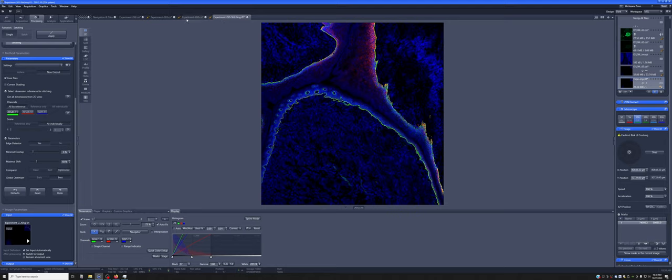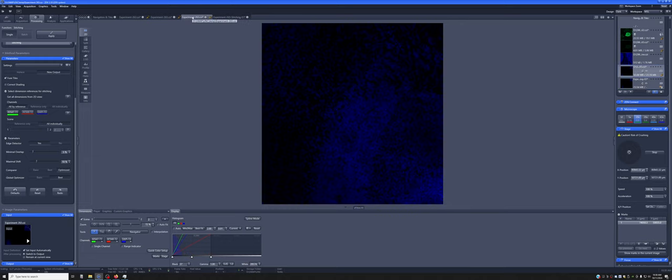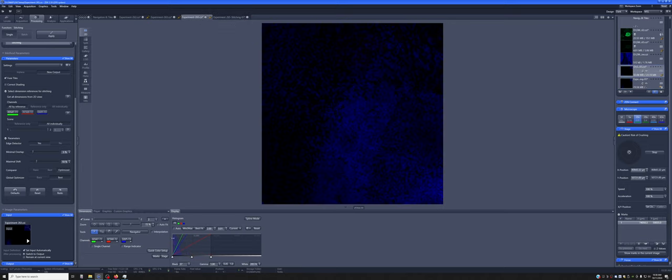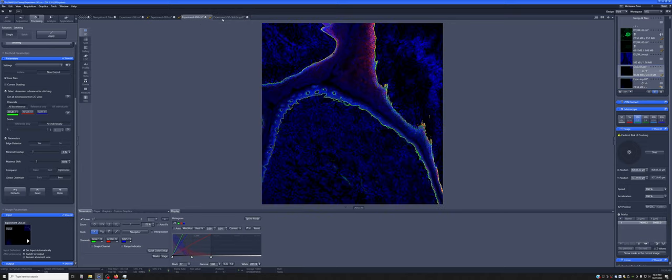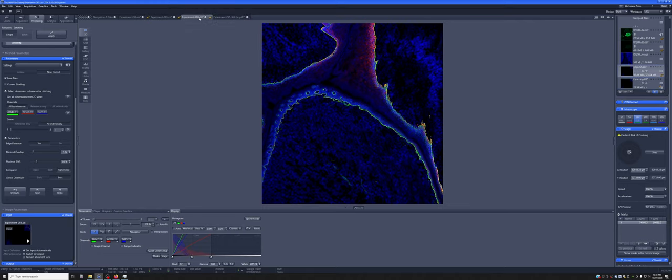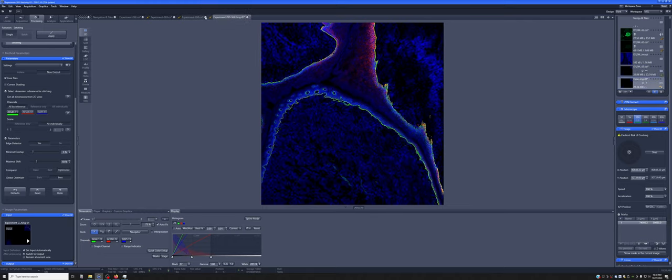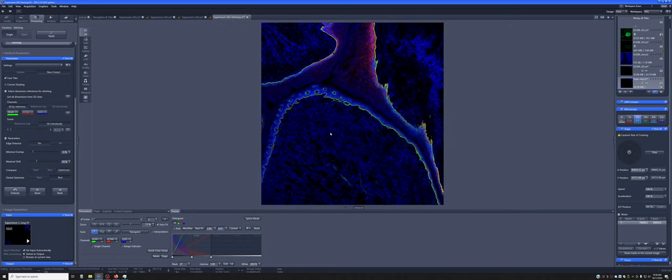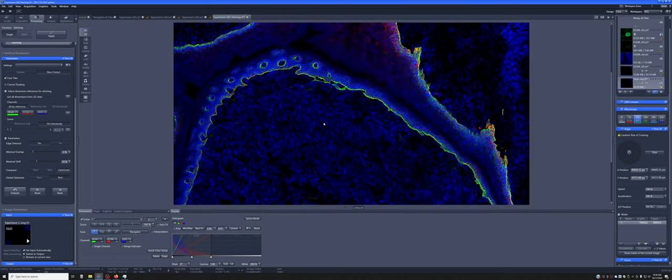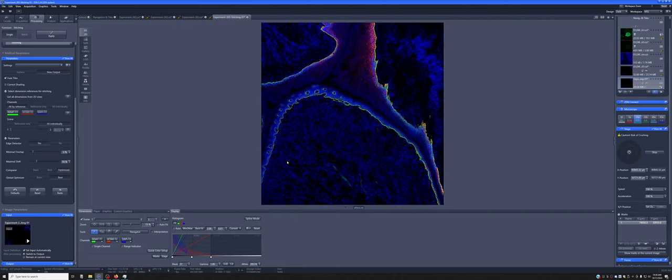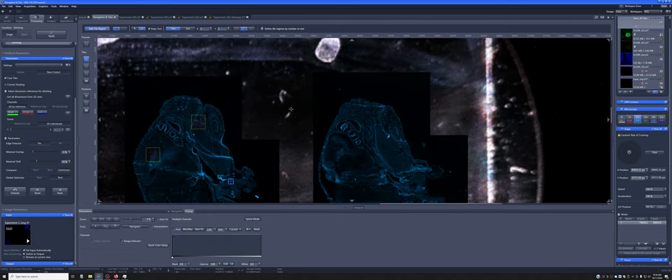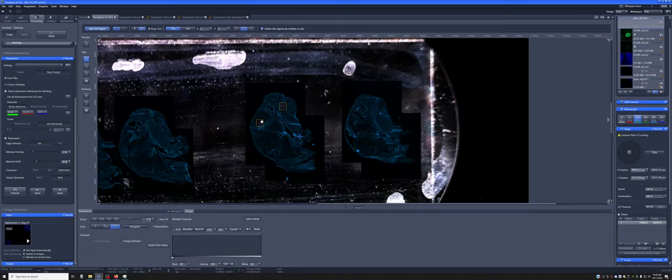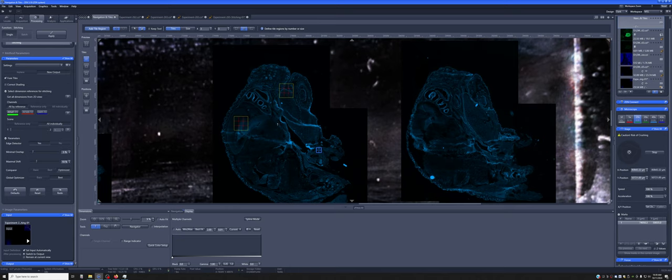So I didn't do this, but in your case, I would save this file with an appropriate name before you do the stitching. So then the stitching has an appropriate name as well. And if you look carefully at these, you can see when you switch between them, there's a slight adjustment that happened in the region of the junctions. If you look very closely at those junctions, you may be able to detect those slight imperfections that I mentioned before. So this is one way of adding tiles to your image.